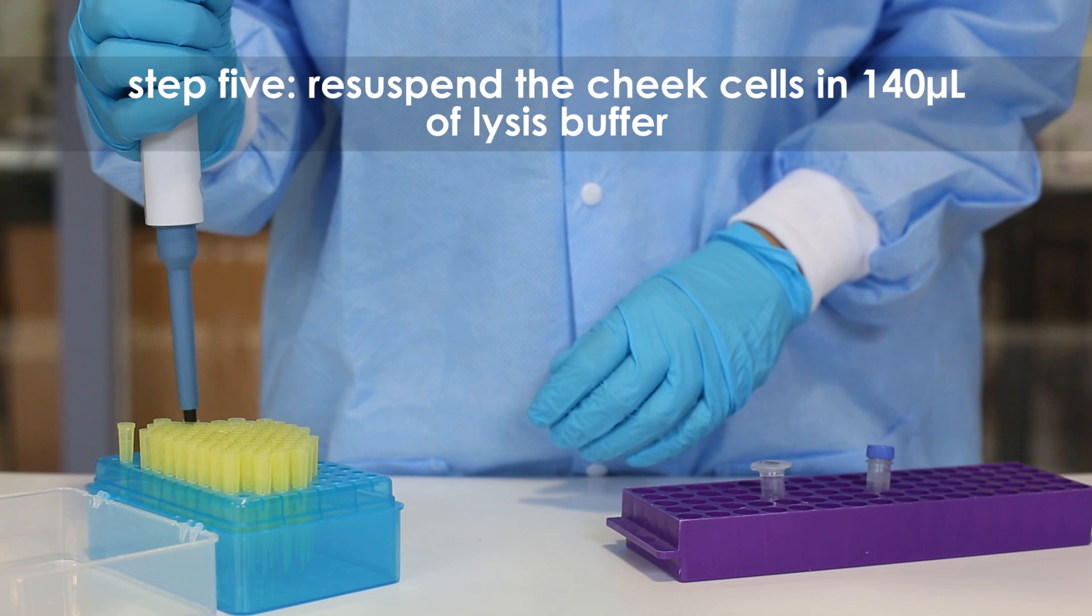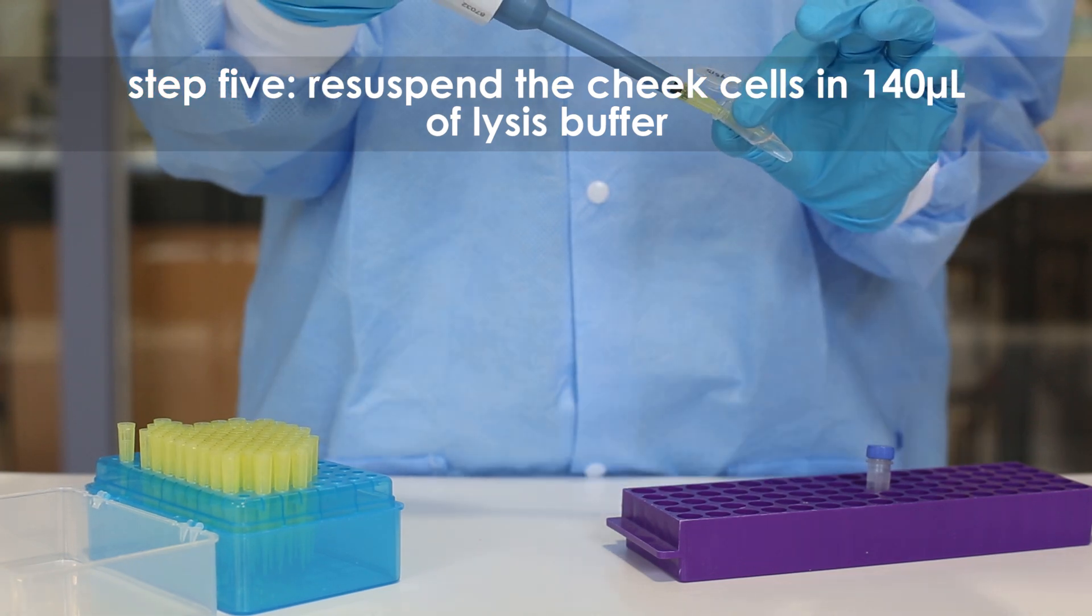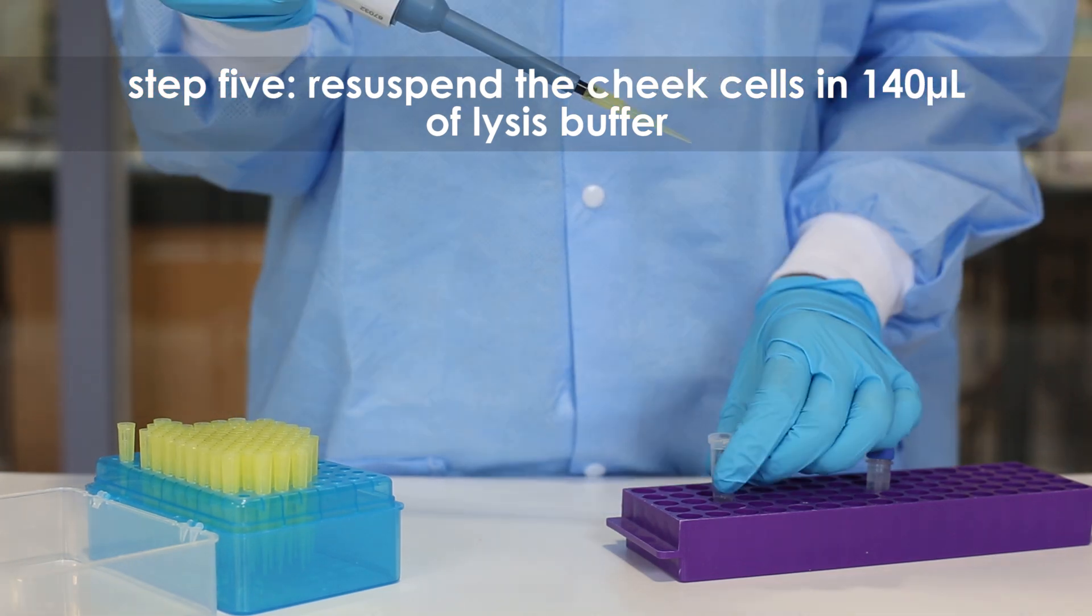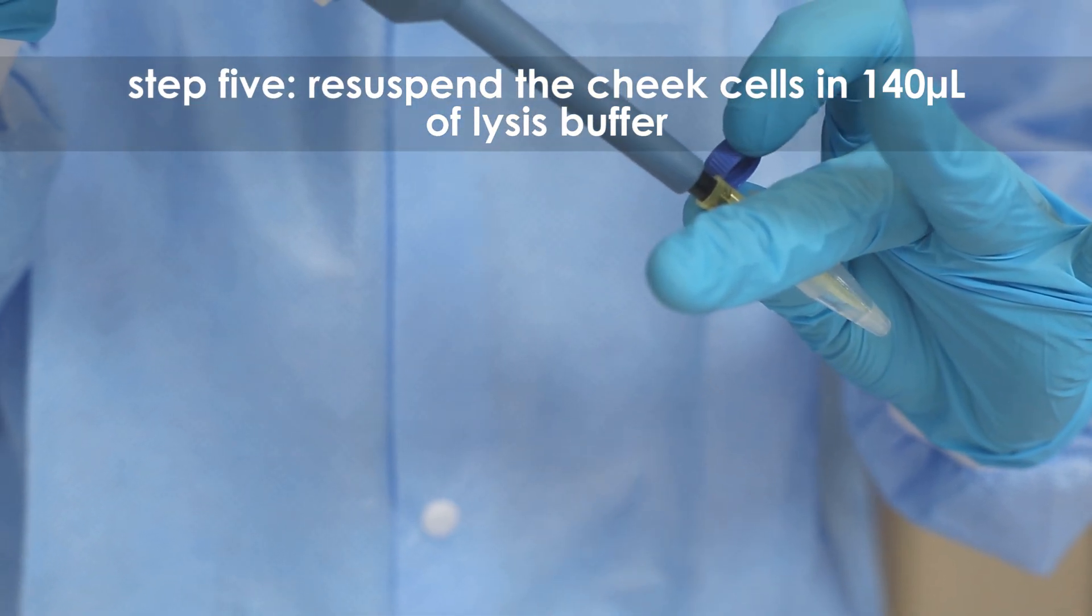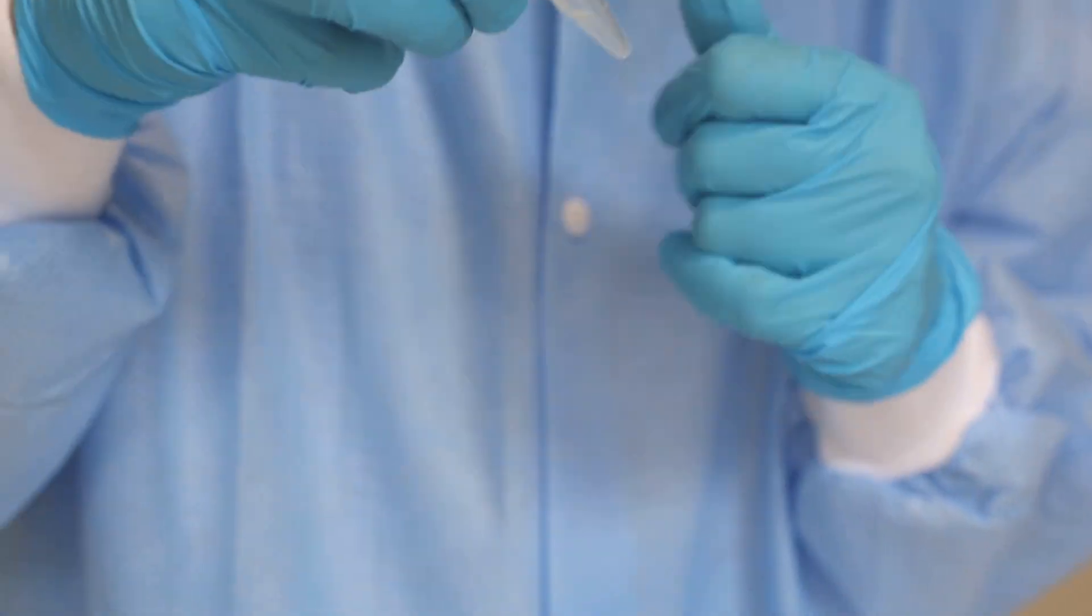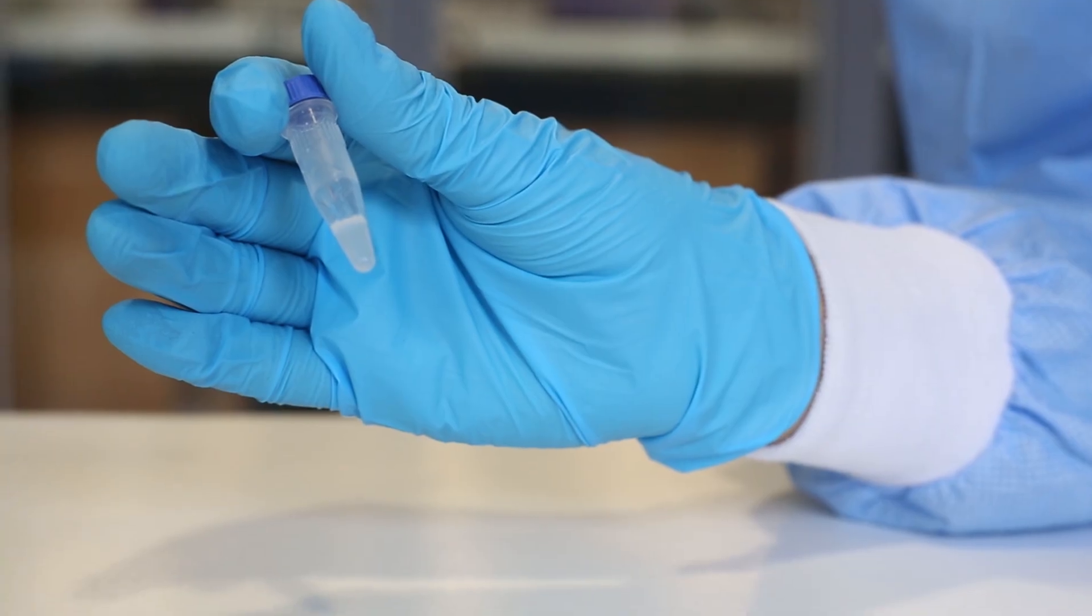Step 5: After you have a sufficient cell pellet, resuspend the cheek cells in 140 microliters of lysis buffer. Mix until no clumps of cells are visible. The cell suspension should look cloudy.